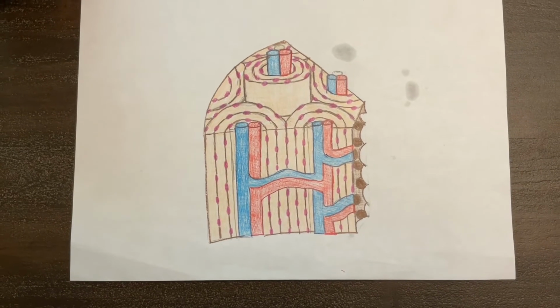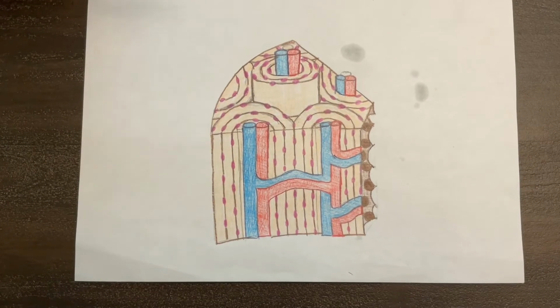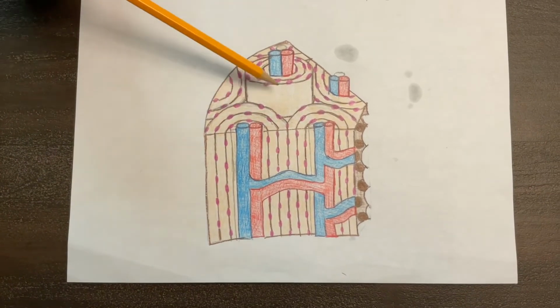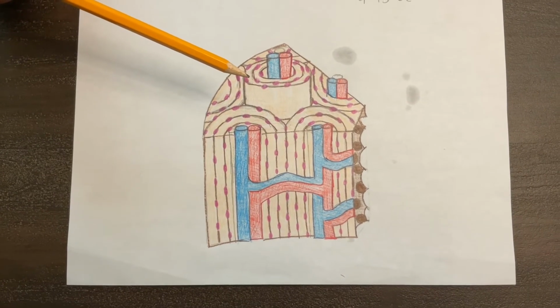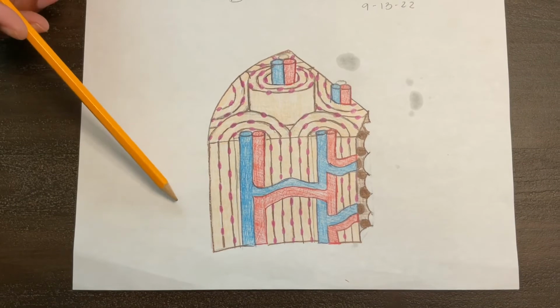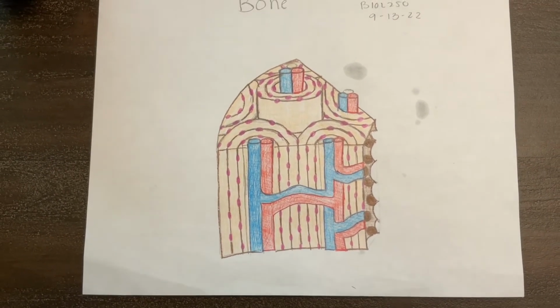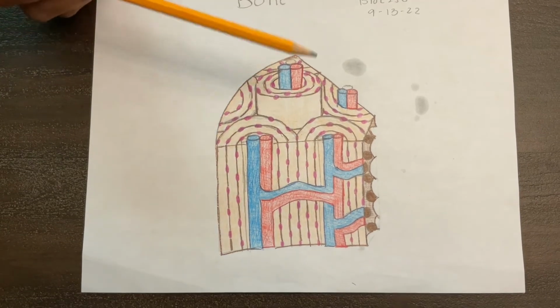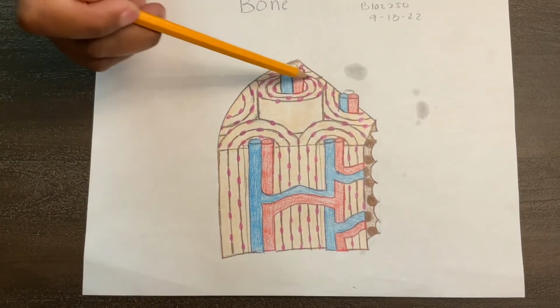The osteocyte is right here. The osteon is right here. The periosteum is right over here. And I don't remember if I said the concentric lamellae, which is right in here.